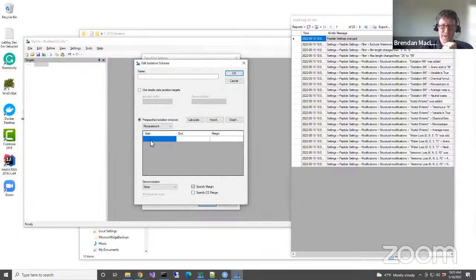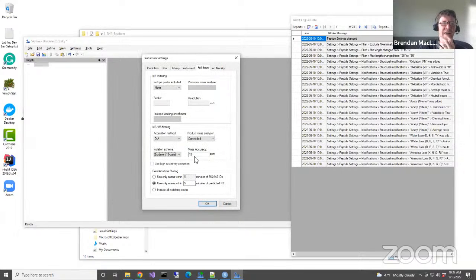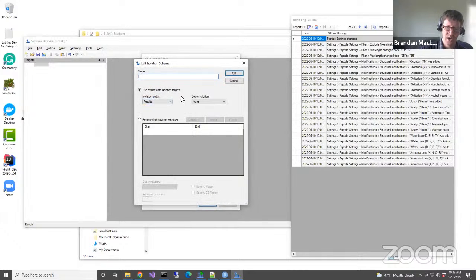You see this blue, and then you just press Control V to paste in something that somebody else has supplied. And a final option, and I think this would work okay for this tutorial, is you could add and just go pre-specified with 1 m/z margin.